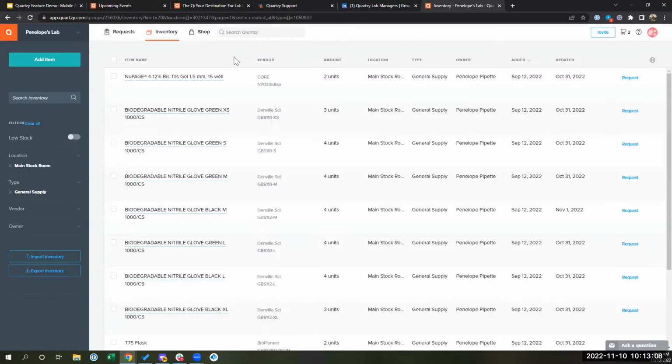Excellent. Yes, this one's related to that. It says we barcode every item in our inventory. Do you have plans to allow printing of barcodes from different medium? For example, a WASP printer that makes small labels from a continuous roll. That is something that we will be considering, definitely different sizes and formats. But again, if you are already generating barcodes with the printer, we can easily accommodate that.